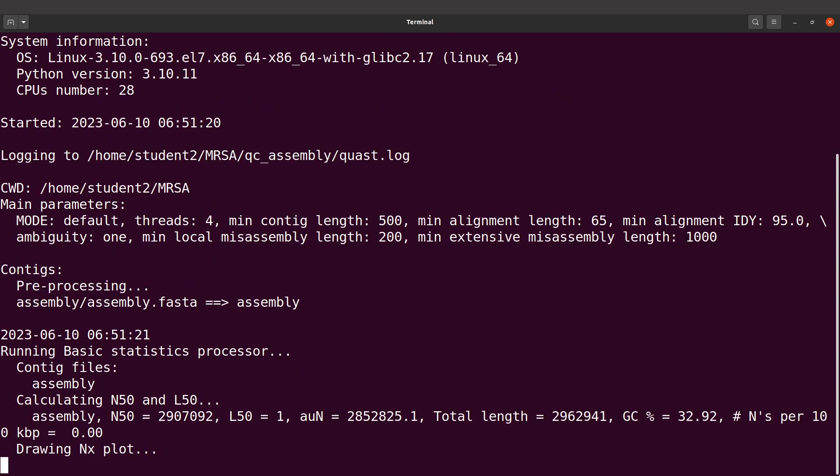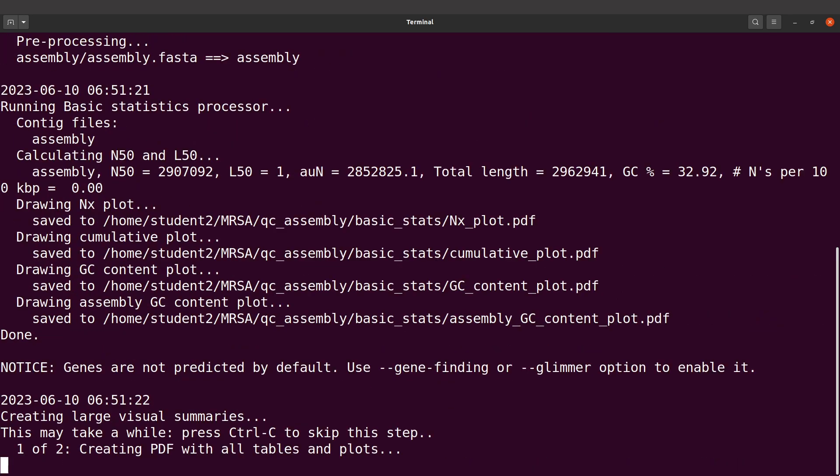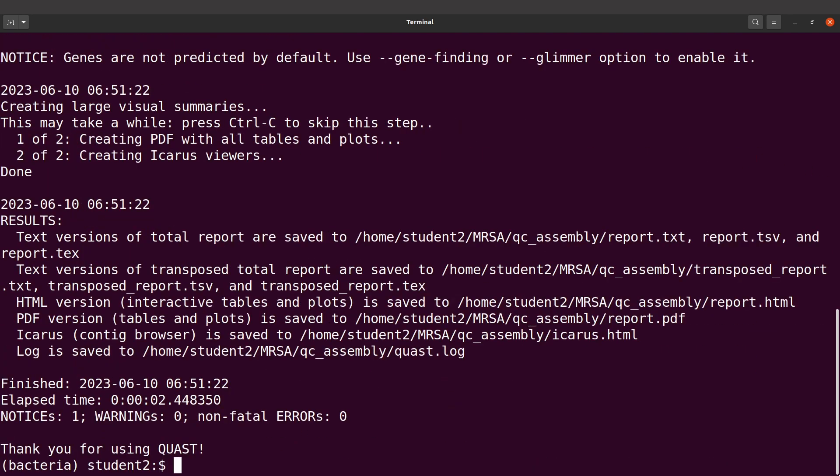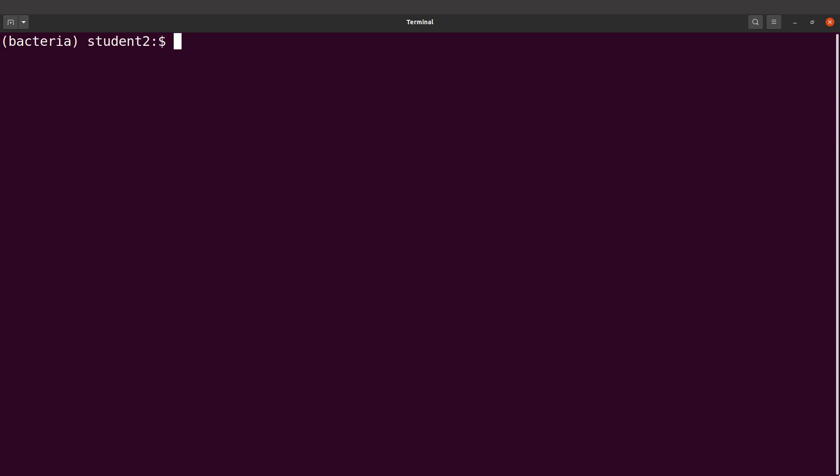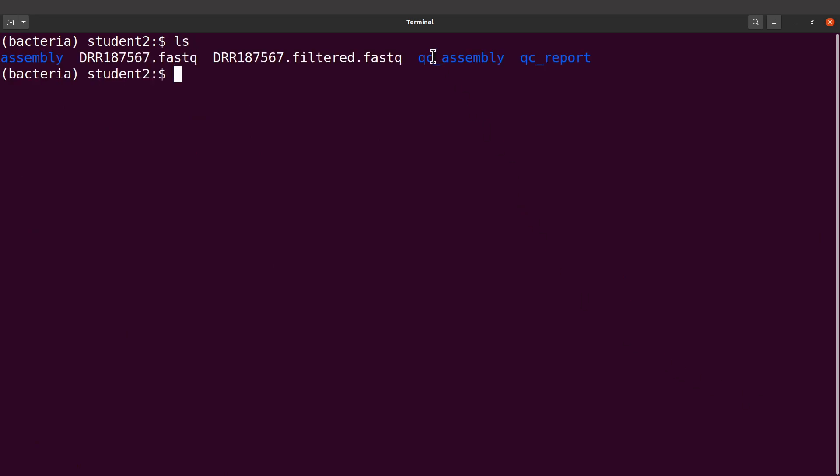Once we do that, QUAST will perform the analysis and give us the outputs. Everything has been done for us now. Let's take a look at the files. Let's do an ls, and we are going to find a directory called qc_assembly. Let's ls into it.